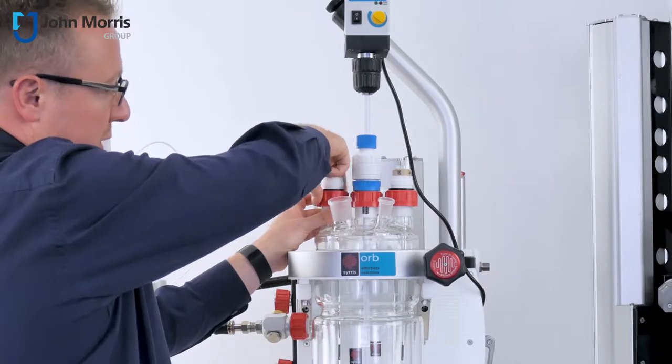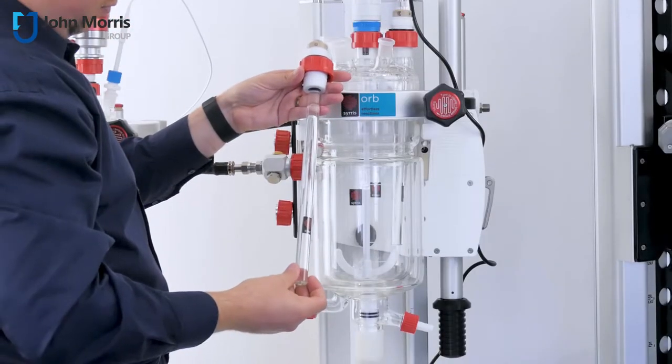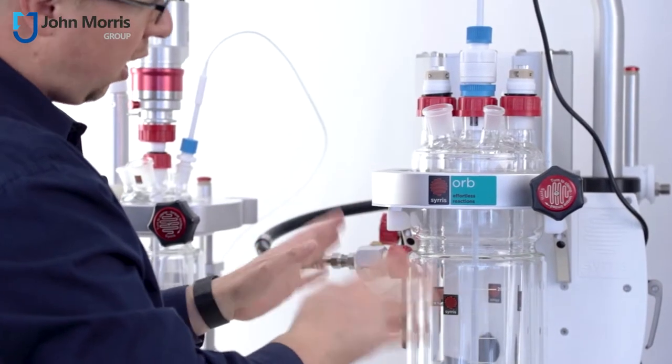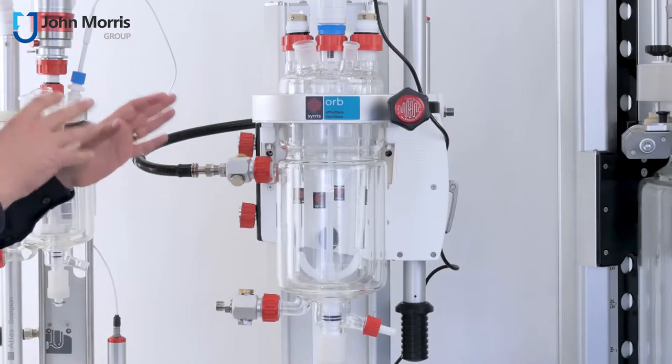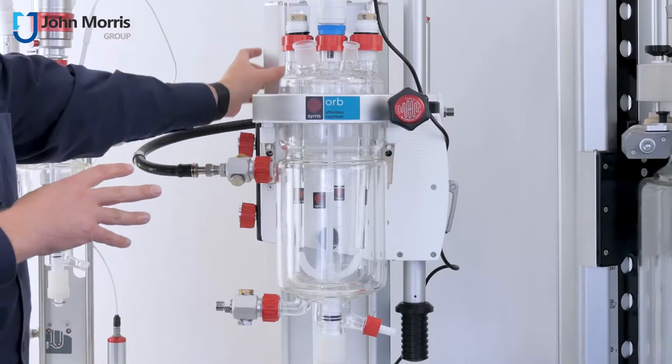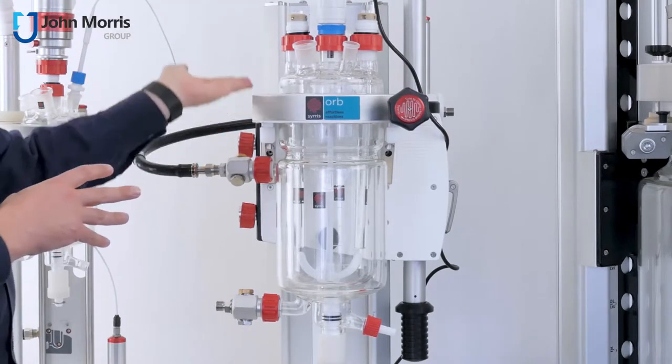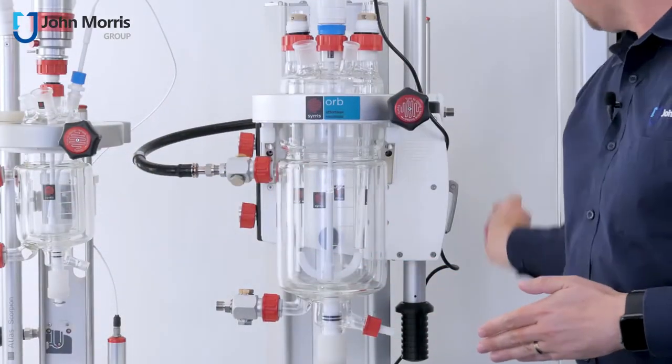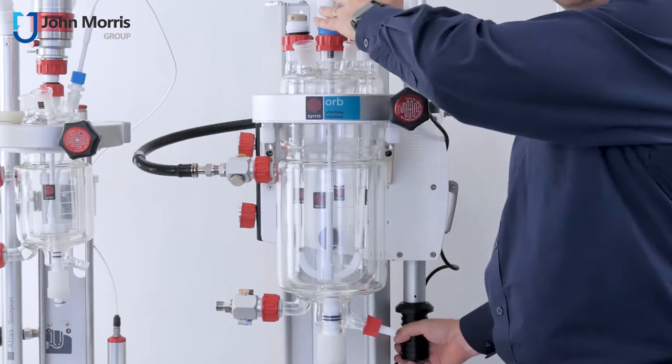To show you a little bit more about the glass baffles I'm going to take one off. Because it's glass it's very easy to clean and highly chemically resistant. Part of the reason that you can put so many different types of glassware on this unit is that the back unit here is very configurable in terms of height lifting up and down the frame and over here we have a device that enables us to lift up and down the stirrer, the overhead stirrer.